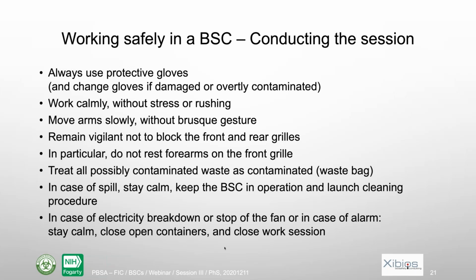It's also the case if there is an electric breakdown, or if the fan would stop, or in case there would be an alarm. In that case, the biosafety cabinet might not be working anymore, especially if there is an electrical breakdown and no emergency electricity. You should stay calm, close open containers, and close the work session. In that case, you stop the work session. You might resume it later, but you should stop it, because in that case, you will not be protected.